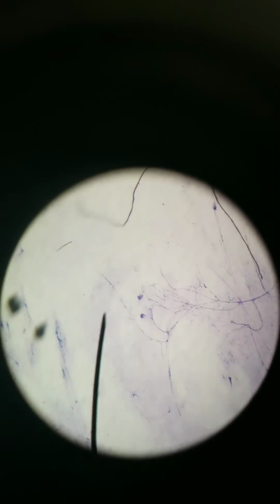Hey y'all, we are looking at nervous tissue right now. Specifically, we're looking at neurons from the spinal cord that have been smeared onto the slide. So they're not within an intact spinal cord, which we will see in another slide, but these are neurons that have been smeared on, so we can see individual parts of the neurons. So let's take a look.